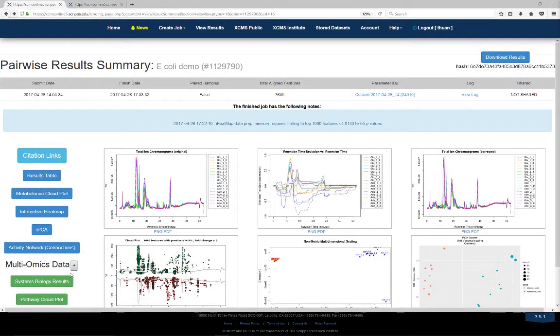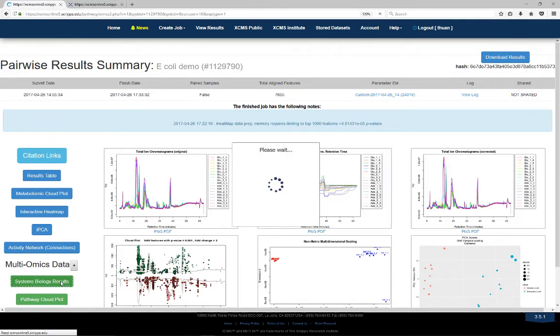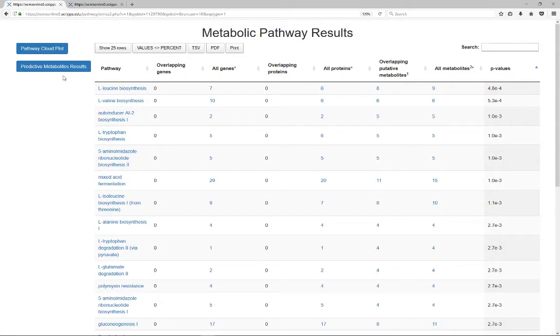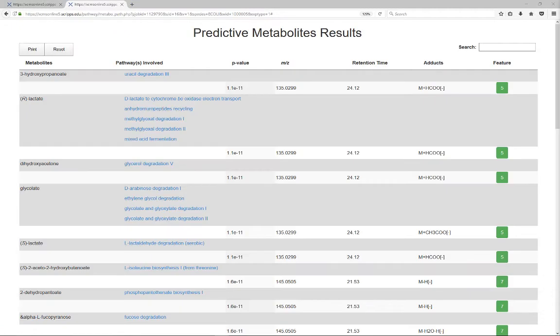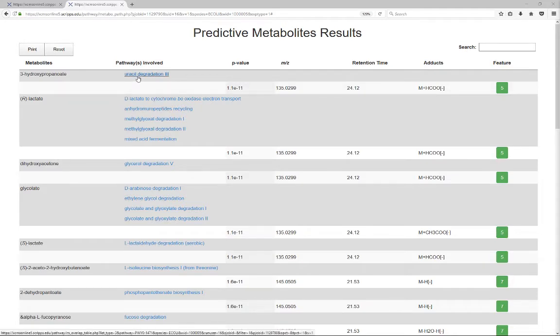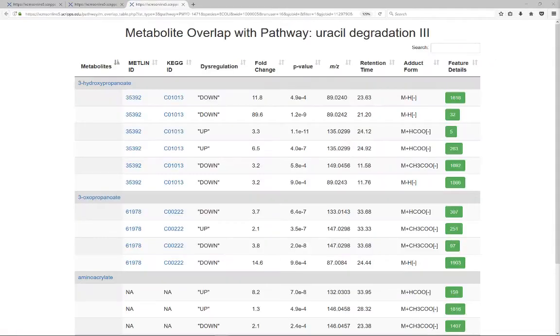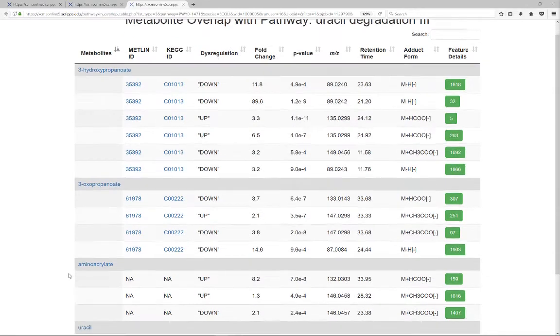In addition, the entire list of dysregulated metabolic features can be accessed by clicking the predicted metabolites results inside the systems biology results. Click the name of the pathway involved to link to a list of all the overlapping dysregulated metabolites in that pathway.